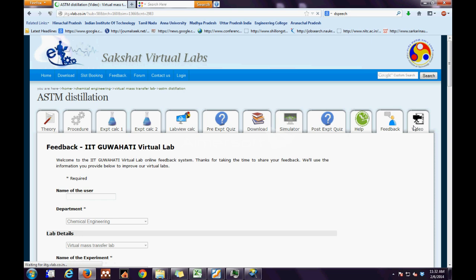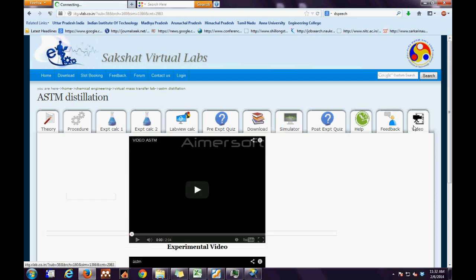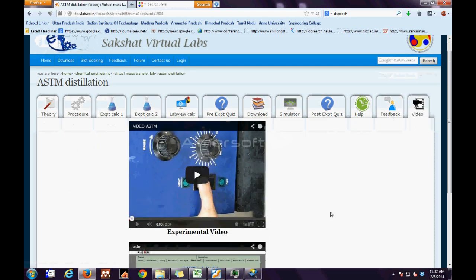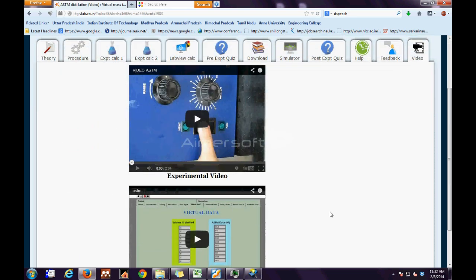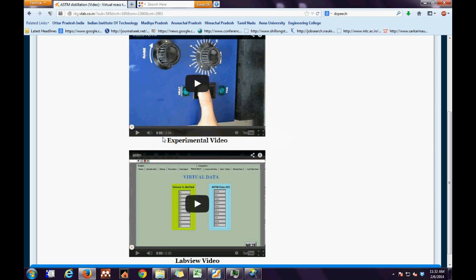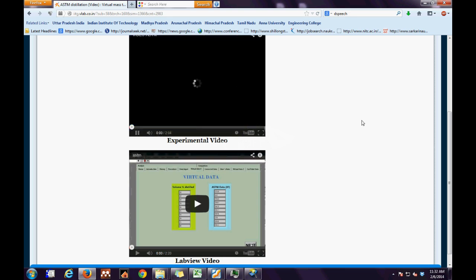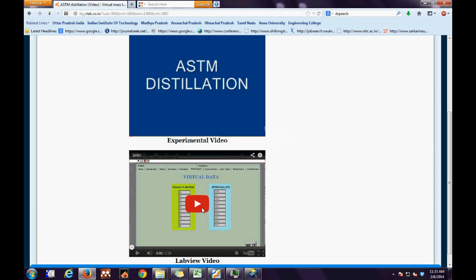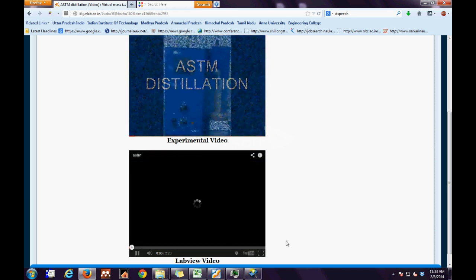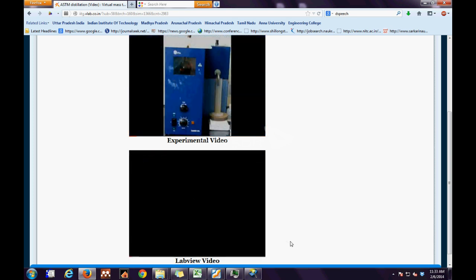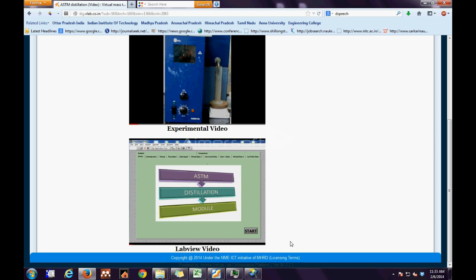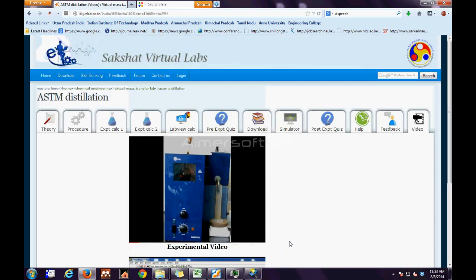Next comes the video tab, which consists of both the real world and the virtual world experimental videos. These videos will further give the user an idea as to how the real world experiment looks and how the virtual world experiment looks.